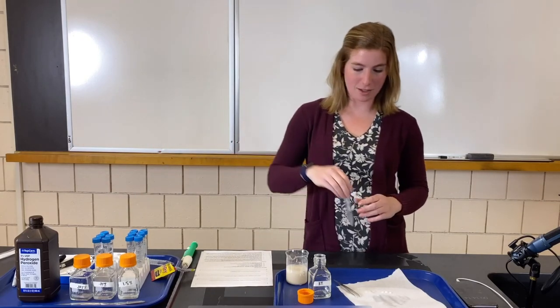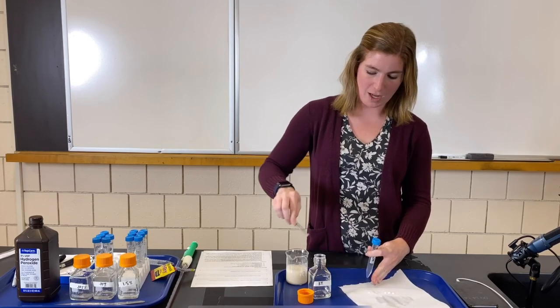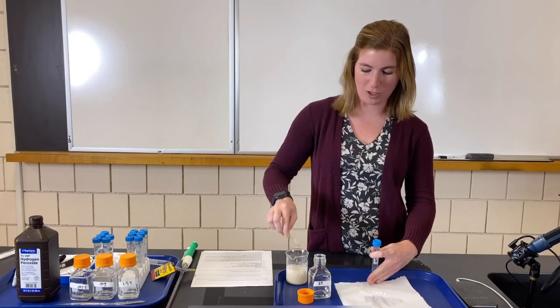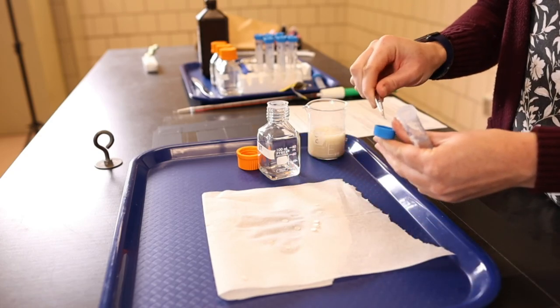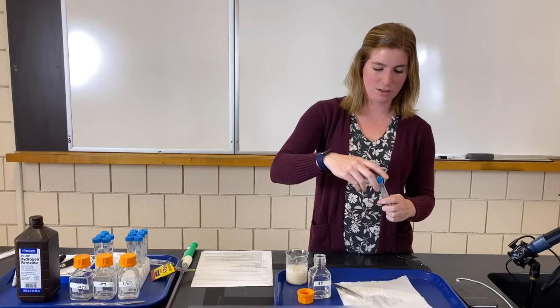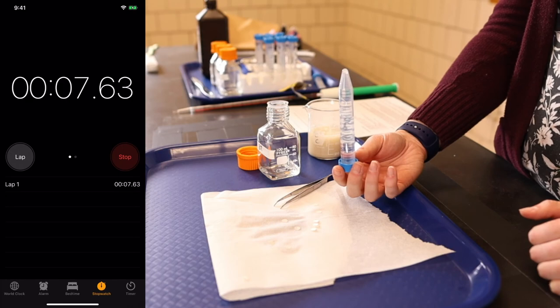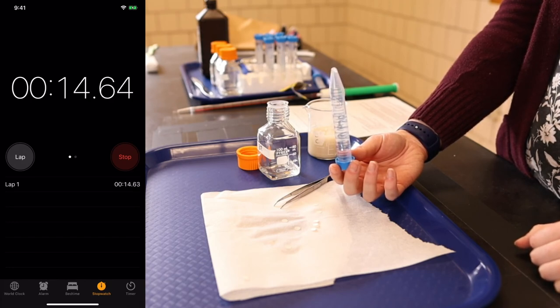We've done our two highest concentrations. Make a hypothesis right now about what you think will happen to the time as I do the lower concentrations. You might be thinking this is about to get boring because it'll take longer. Now we're on trial one of 0.75% hydrogen peroxide. In any real experiment there's always room for error — a fluke in one trial is okay, which is why we take the average of all three trials.